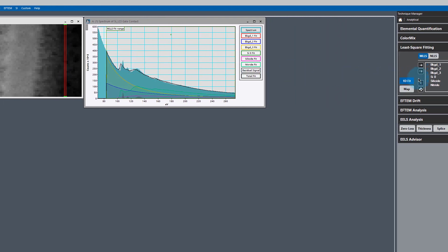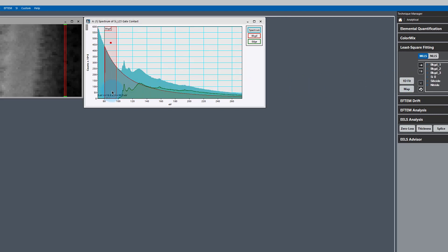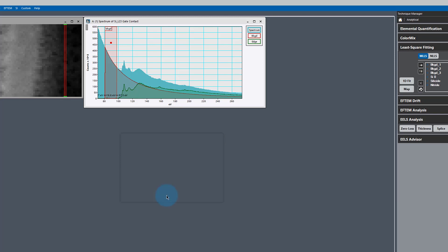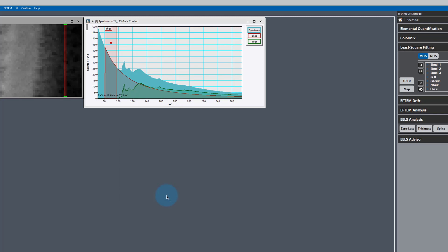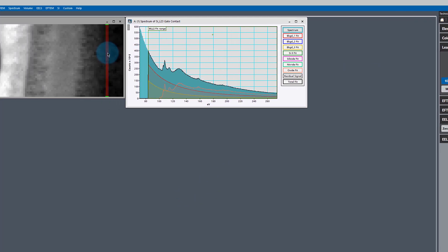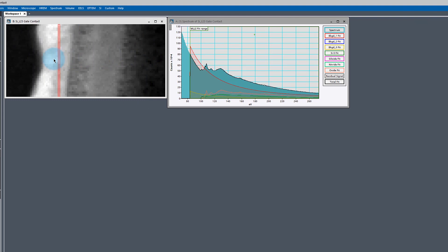I'm just going to turn off my fit again, check and make sure the background looks good, which it does. We can move around just a little bit and add this. This time I'm just going to add the edge. We'll call this oxide. Now we've got our references and we can do the fit.